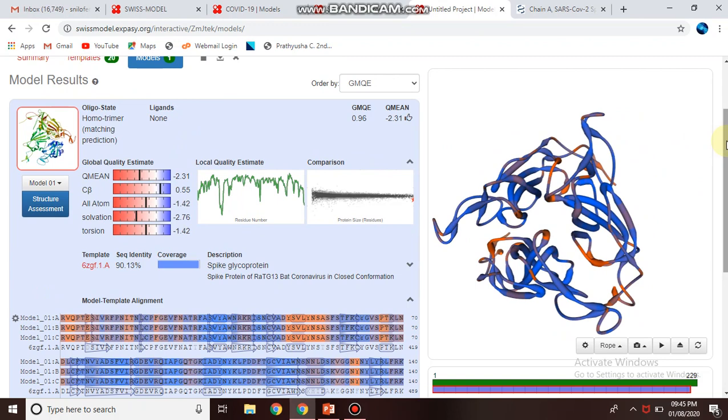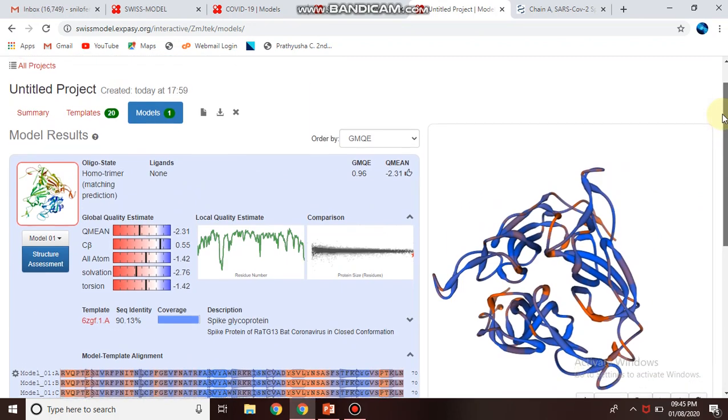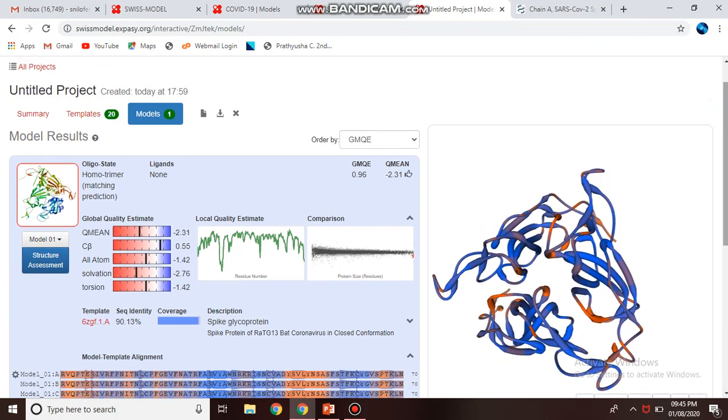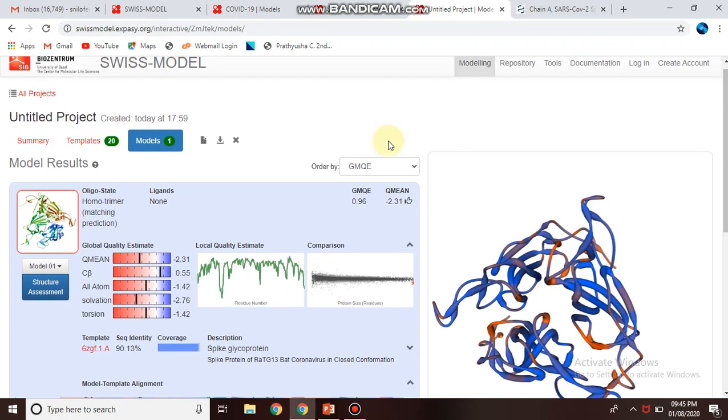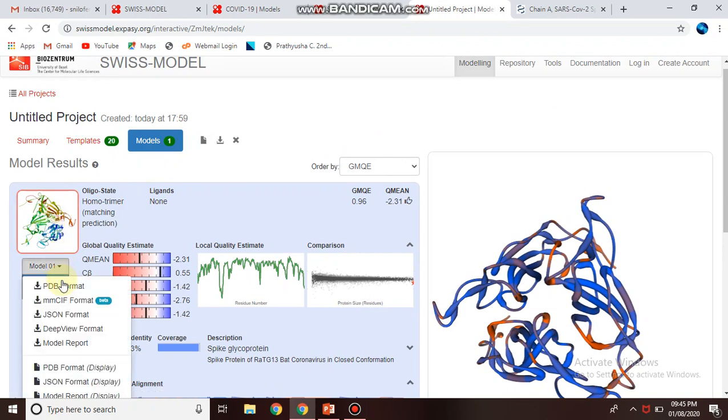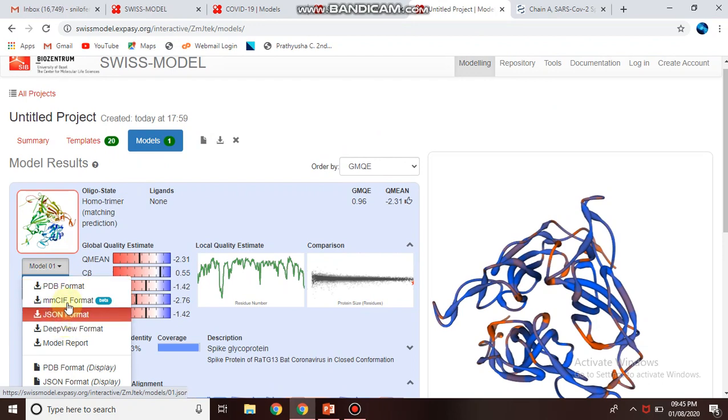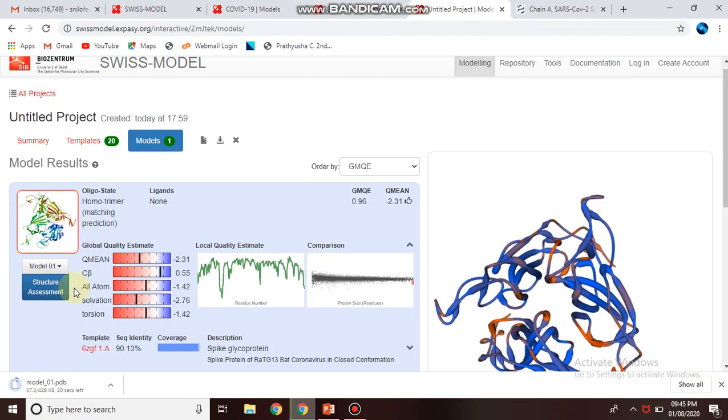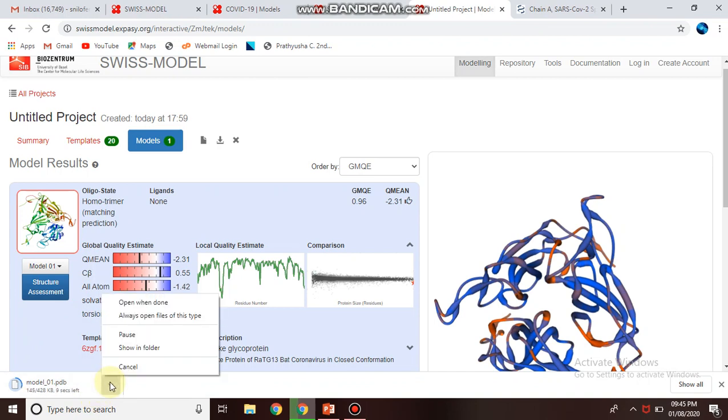Like this, by using simply the sequence, you can generate the 3D structure of your protein and directly download in PDB format or any format you require. PDB format is very important and you can directly use this for further docking study.